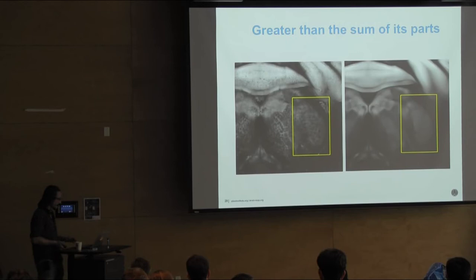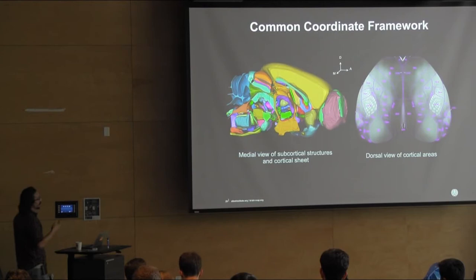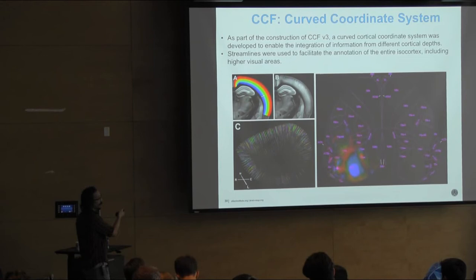And that provides these three-dimensional structures. There's also a top-down version that I just showed when Eva asked her question for each of these experiments, or for some of these experiments. And there's an additional coordinate system, the flat map coordinate system, that I won't be talking as much about, but it's a cortical depth coordinate system, x, y instead of x, y, z, x star, y star instead of x, y, z, following these streamlines through the cortex. And then this is what that intrinsic signal image map looks like.